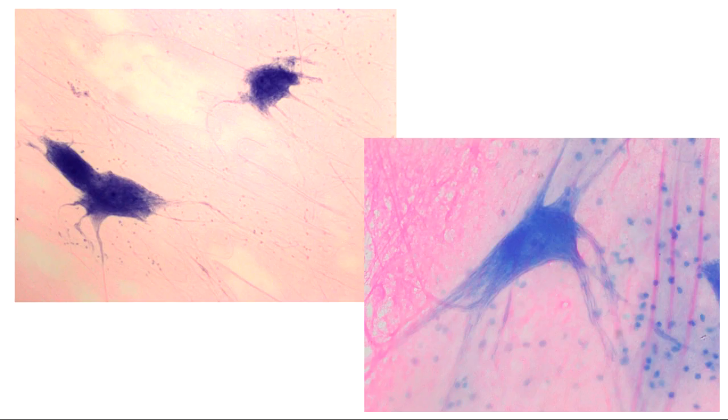I'm going to nerd out on you a little bit here and zoom in close on it. You can see again those dark neurons that I see here. This one's a little bit more bright blue. But here I want to point out this little section right here. I'm going to draw a little circle around it. That little section in there, the light spot is the nucleus. And in the very middle of the nucleus, we have a thing, I'm pretty sure we learned about it, the nucleolus.